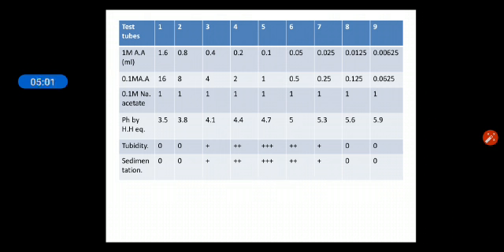casein molecules will have the isoelectric pH and will have the highest tendency to settle down in the test tubes and minimum tendency to be dissolved.